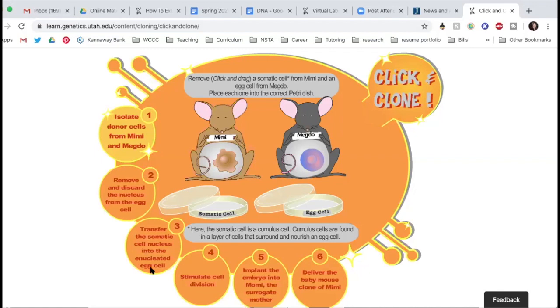Transfer the somatic cell nucleus into the enucleated egg cell — the egg cell without its nucleus. Then stimulate cell division. Implant the embryo into Momi, the surrogate mother. Deliver the baby mouse clone of Mimi. So let's take a look at step one. Click and drag a somatic cell from Mimi and an egg cell — put Mimi's somatic cell in a Petri dish, and then take the egg cell.